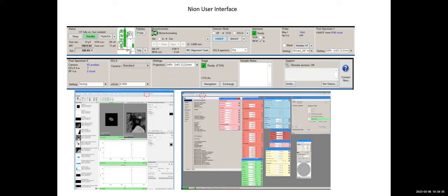So if we think about the aberration in a round lens system, those values are unknown and you need to find them out. If you want to find them out using your eye, yeah, you can correct the lower order values like the astigmatism using a Ronchigram, or hopefully you can also correct coma to a certain precision. But if it is beyond that, it's very hard for you to judge those aberration coefficients from your eye. So we need to have a program to help us.